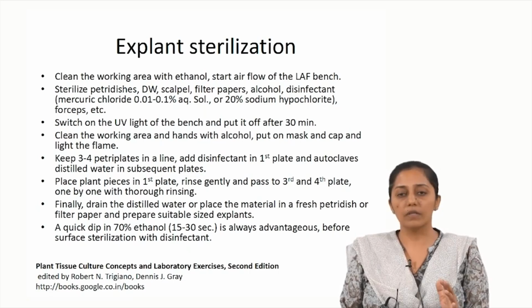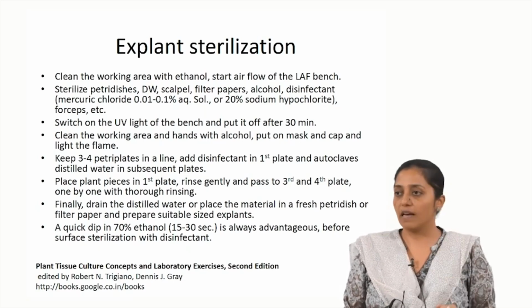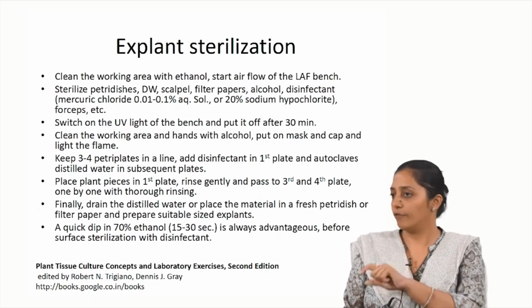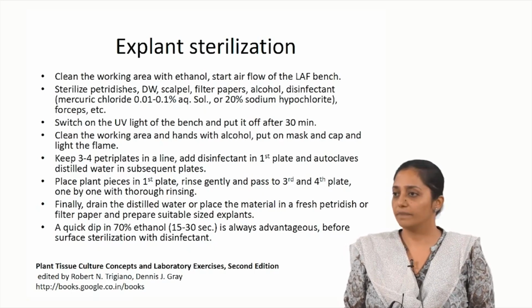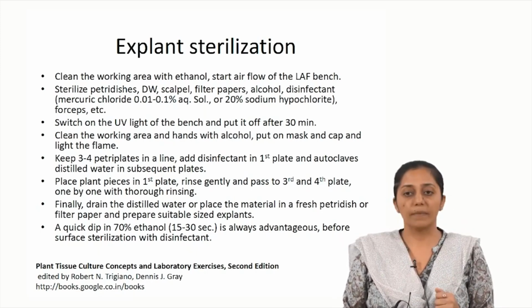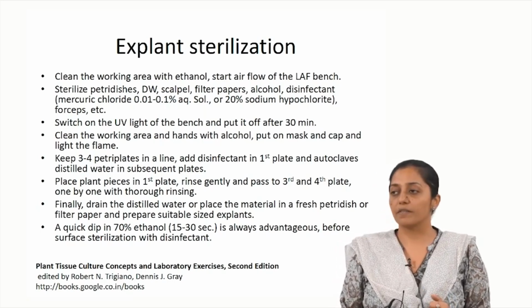Now, the laminar hood. What is a laminar hood? Have you used a laminar hood? Yes. So, what is it? Laminar air flow. Why do we use that? Either there is a horizontal flow or there is a vertical flow. So, how is it maintaining the aseptic conditions? How is that positive pressure being created?